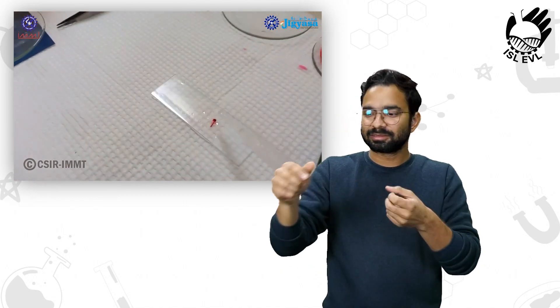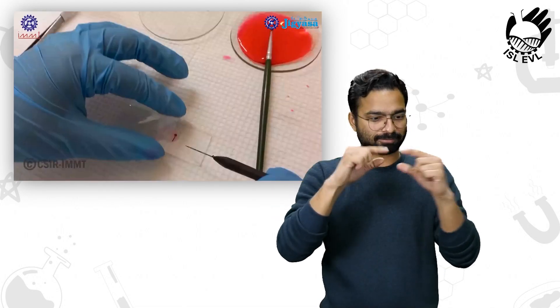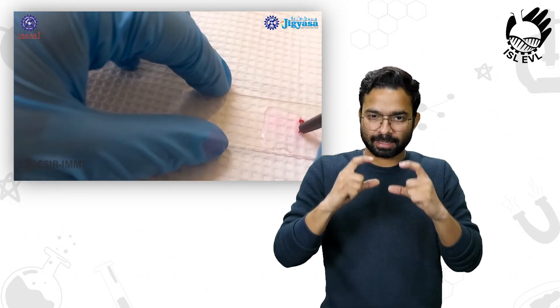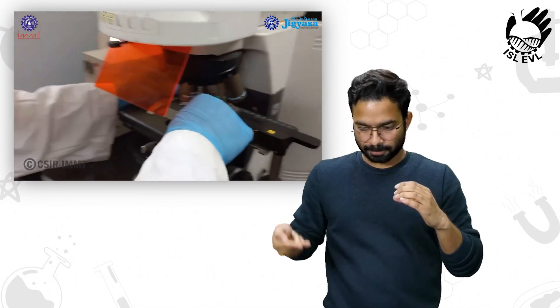We will mount the slide using one to two drops of glycerin. Then place the cover slip with the help of the needle so that there will be no bubbles, and press the cover slip gently with the needle.